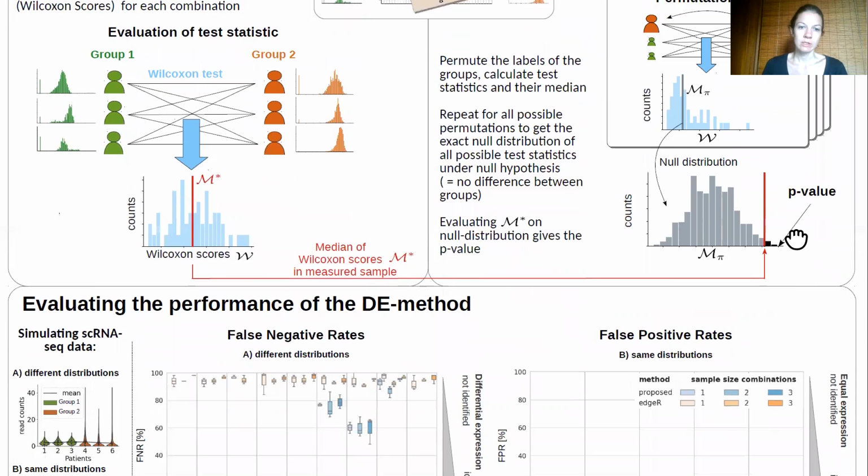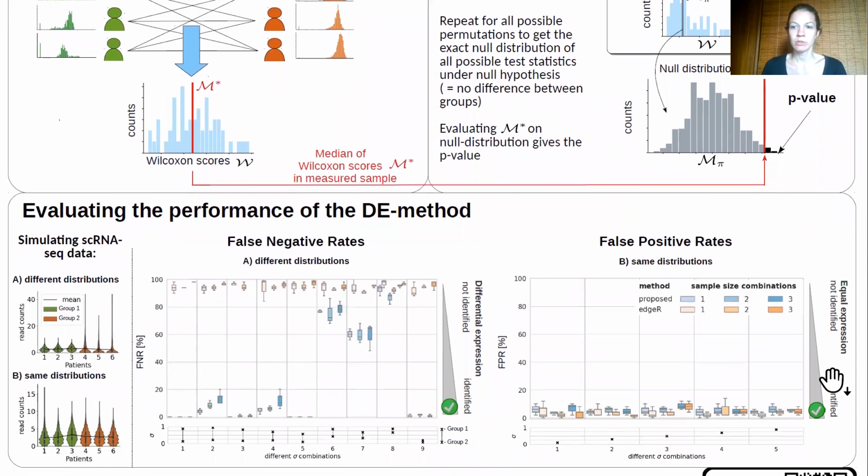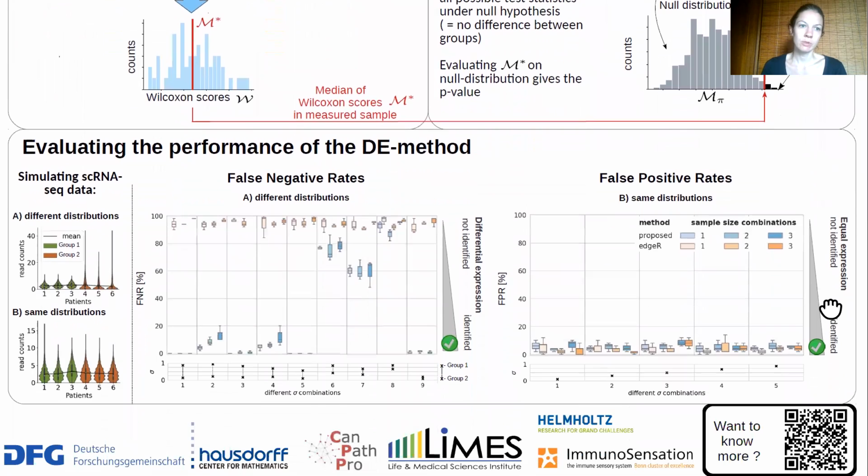But how does this newly proposed method perform? We evaluated the performance of the differential expression analysis method by simulating different single-cell RNA sequencing data sets. We were looking at two different cases for now.